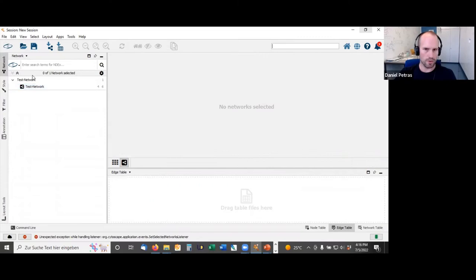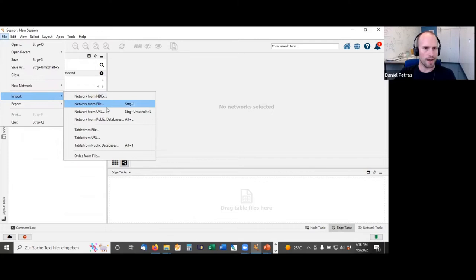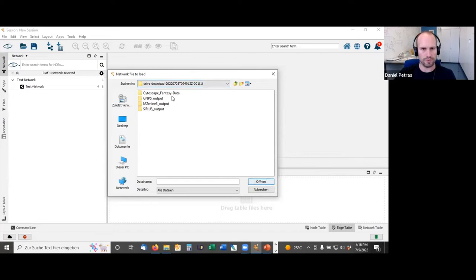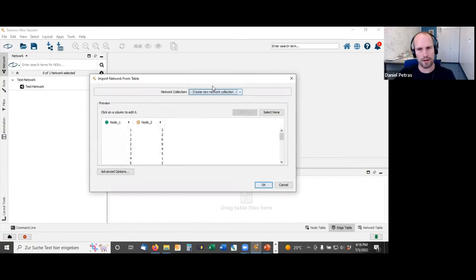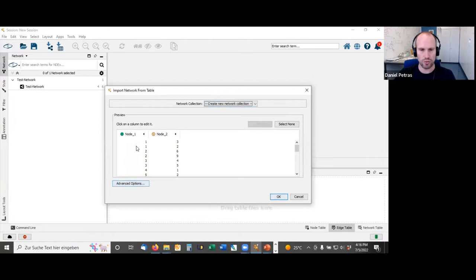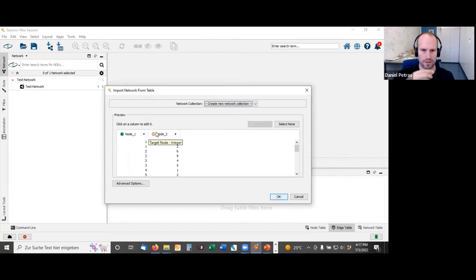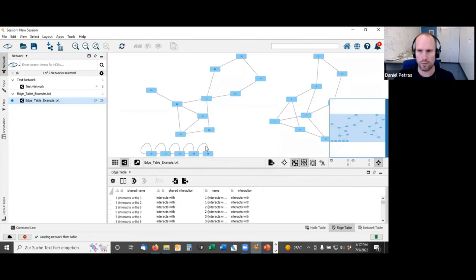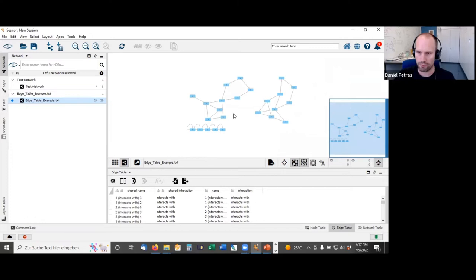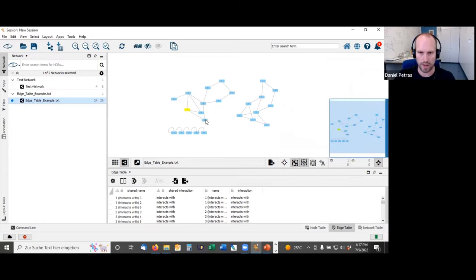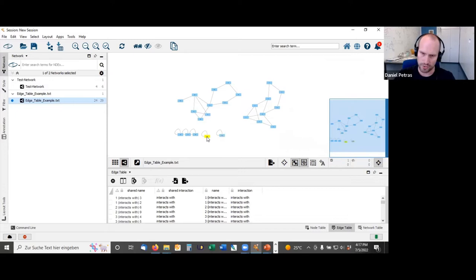To import this, go to File > Import > Network from File, navigate to the cytoscape fantasy data folder, select the edge table, and the import wizard will recognize the two columns, calling one 'source' and one 'target.' That defines the connection — there's a source node and a target node. Click OK and it imports the network. Now I have my little fantasy network with two sub-networks and a bunch of singletons. I can click on nodes, organize them, and move them around.